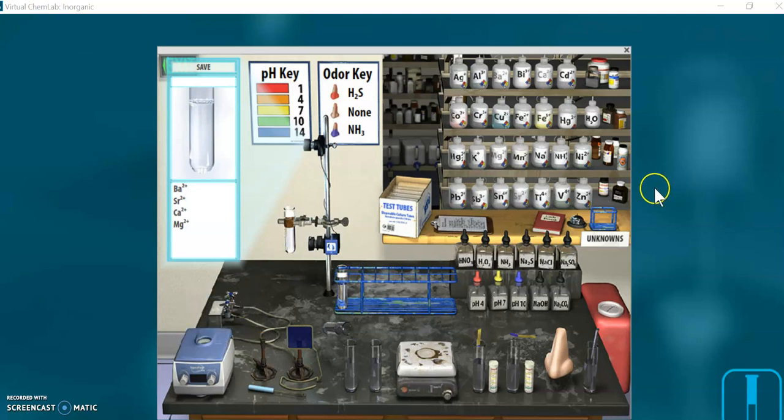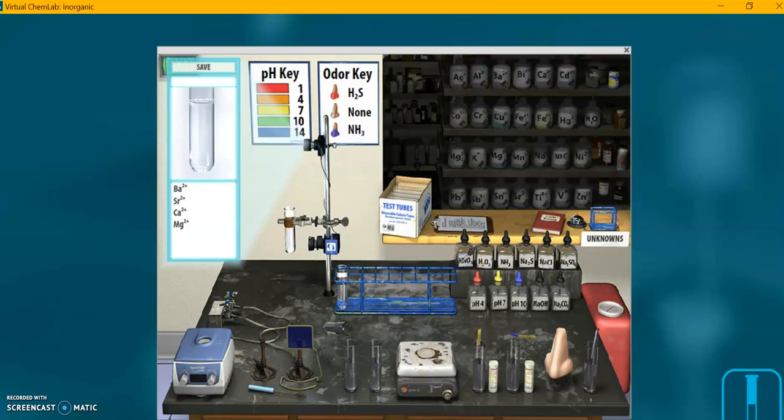I'm going to add some nitric acid. I'm just going to click on it. I think that puts that in there. You could drag it over and do it that way. I don't think that actually does anything extra. It just seems to add it when you click on it.